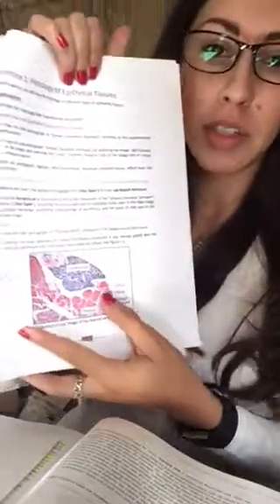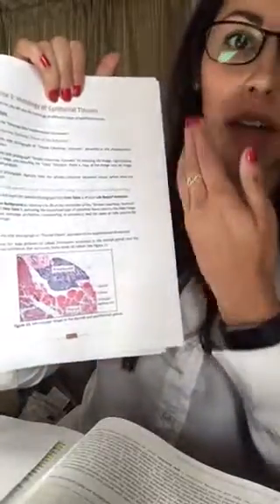Number 7, review the slide of the photography of the thyroid gland provided in the supplement document. Observe the large globules of the colloid hormones produced in the thyroid gland and the follicular epithelium that surrounds these areas of colloid in figure 13. So we have to basically copy these images and put them on the table and label them and identify them. That's for exercise 1.